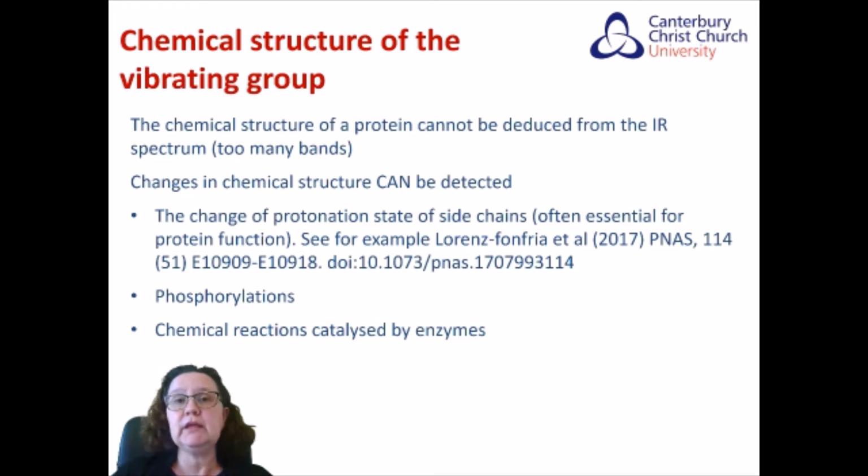And I will be looking later in the video at hydrogen-deuterium exchange, for example, as a way of studying a protein's reactivity.